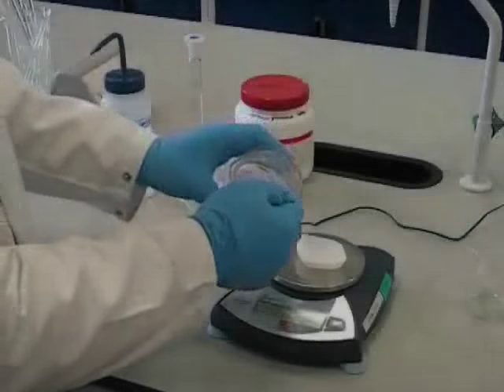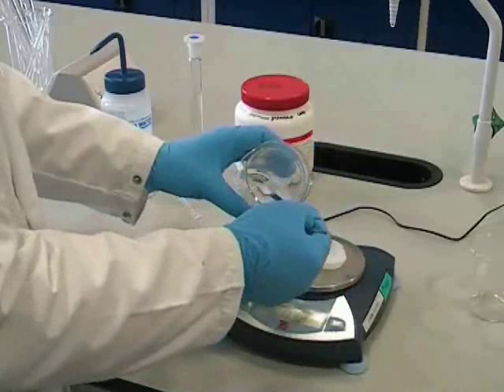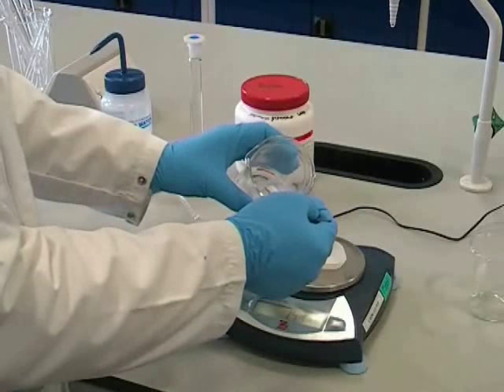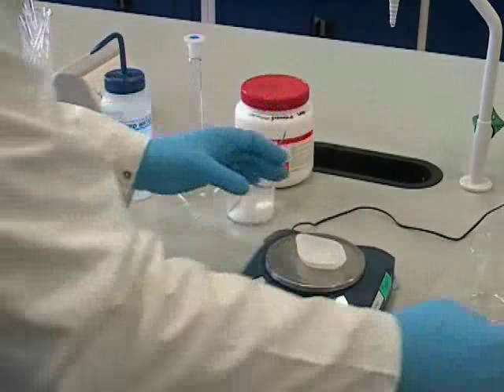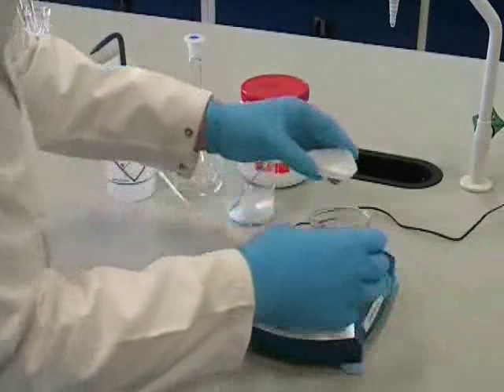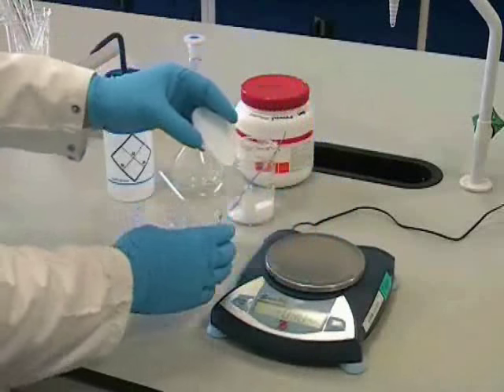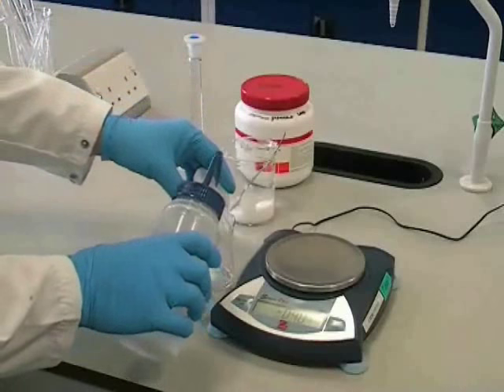After calculating the mass of solute that you need, you can then weigh this into a weighing boat using a top-pan balance. You should use an appropriate balance, probably 1 to 2 or 3 decimal places. After weighing, the solute can then be transferred into a glass beaker. And it's important to make sure that all of the solute is transferred, and to do this, you should rinse the weighing boat with distilled water.